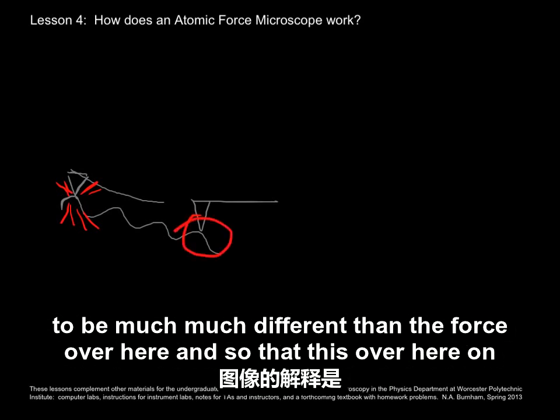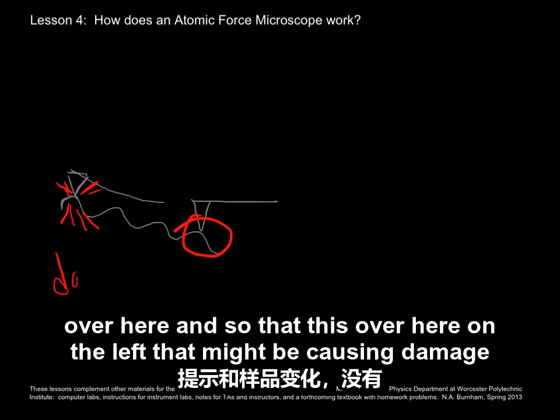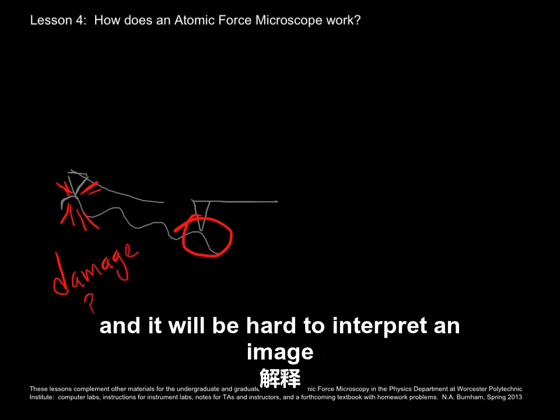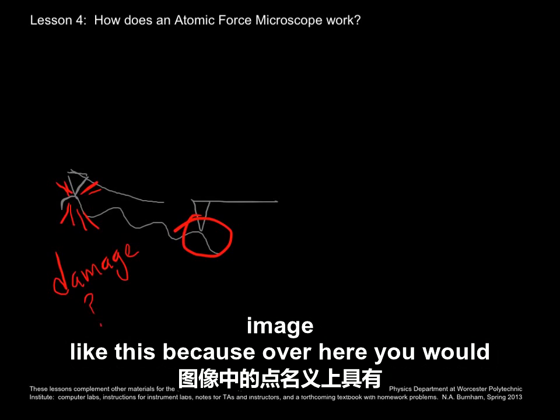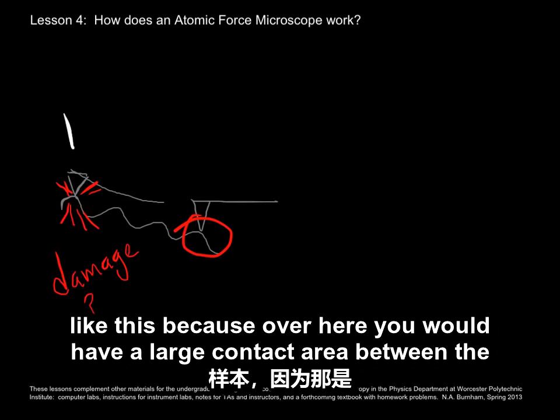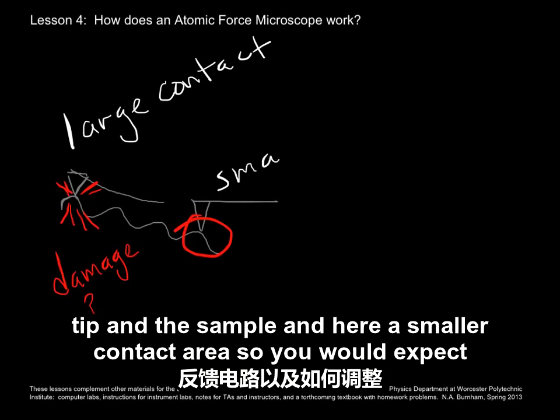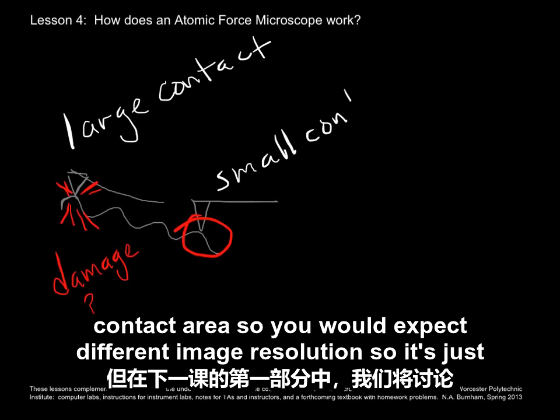And so this over here on the left, that might be causing damage, and it will be hard to interpret an image like this, because over here you would have a large contact area between the tip and the sample, and here a smaller contact area, so you would expect different image resolution.